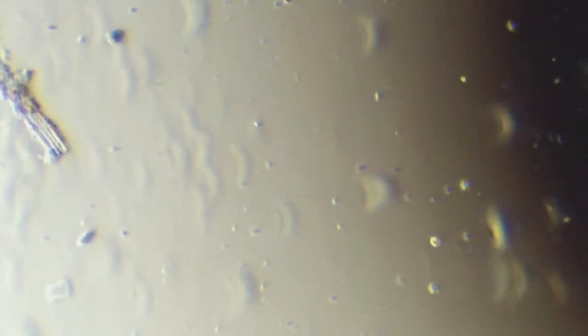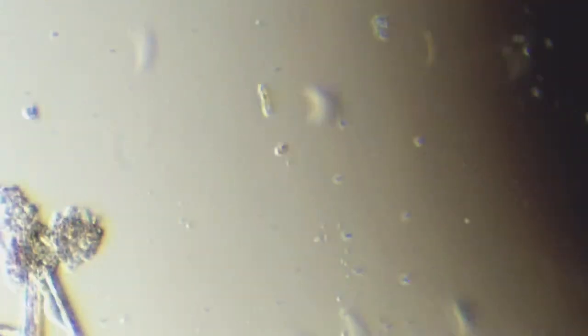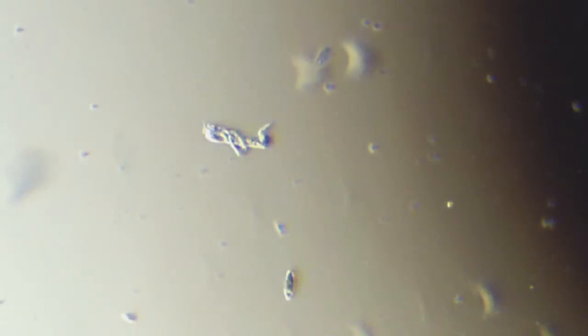Way too fast. This is why sometimes I put methylcellulose on the slide. It's just clear, mucky, inert stuff they use for making slime in movies like Alien and any kind of creature movie where there's lots of slobber and slime, or movies like The Blob. It's harmless to the animals, but it makes a much thicker matrix for them to swim through.